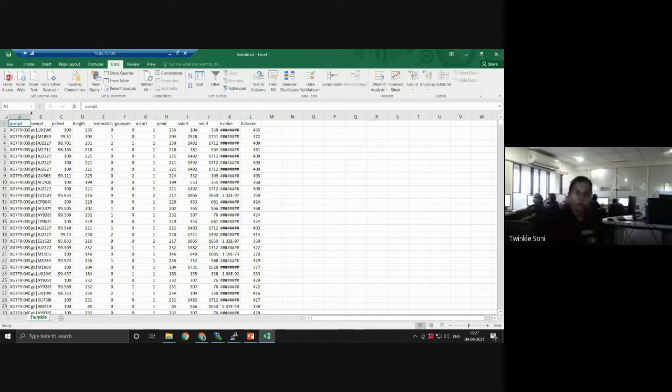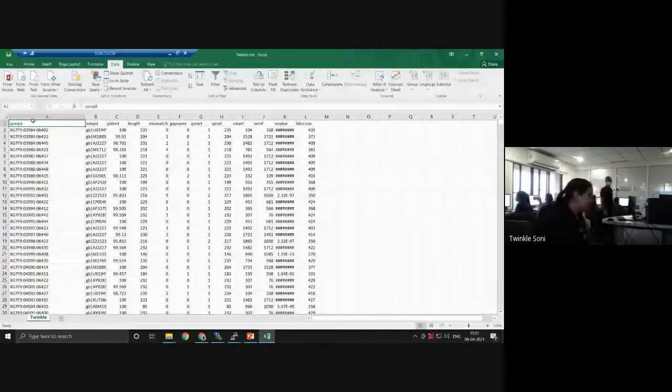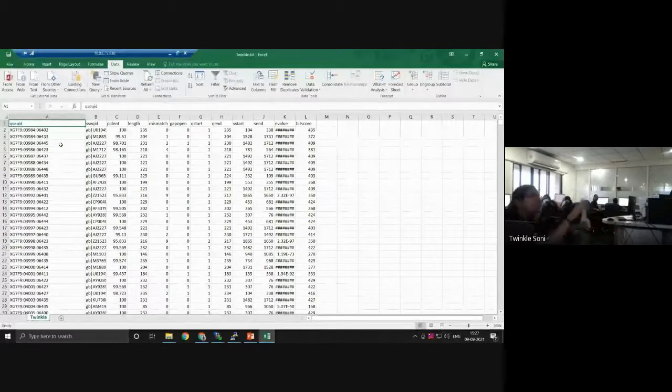Okay. So now the first column is our query sequence ID. It is some kind of automatically generated ID. If we had opened our FASTA file, it should start like any FASTA file should start, with a name preceded by a greater-than sign, and below it will be the nucleotide sequence. So this name is basically our query sequence, as every FASTA has a name in our FASTA file. So these are our query sequences.